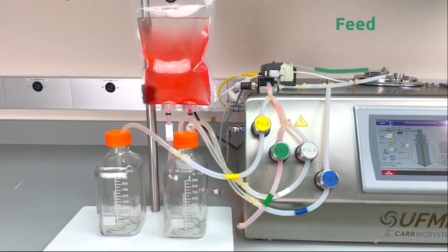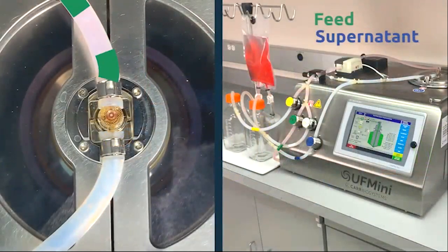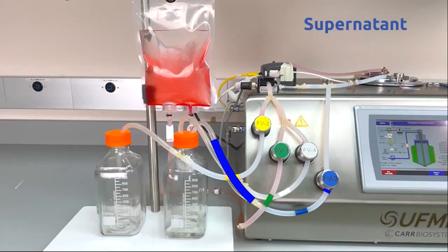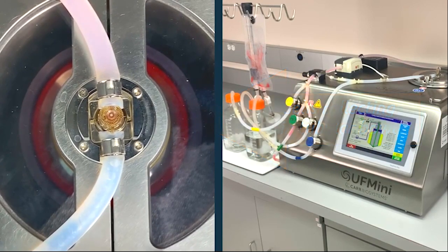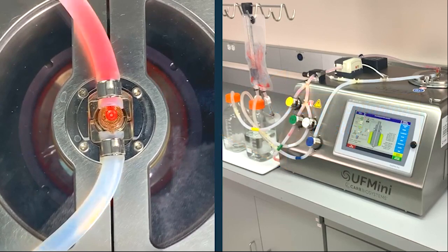The audio is live, but it's not quiet. When the feed starts, you can see our HMI on the right side showing the bowl is in the act of being filled. As the feed is continuously fed to the module, the supernatant is being continuously separated. So the supernatant is being pumped out. And here you can see the dark red color. That's the cells, in this instance the dyed beads, collected on the outside of the walls. It's a very small volume, so we process quickly. So it's ready to stop. The feed has been processed. And now it's discharging that cell concentrate.